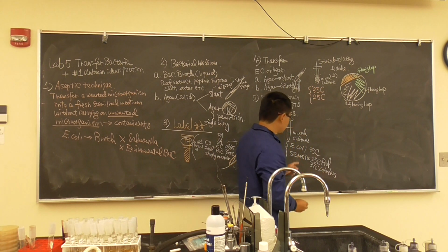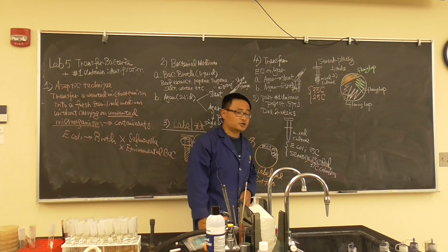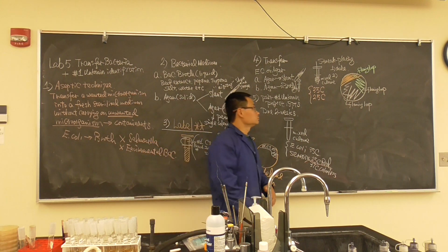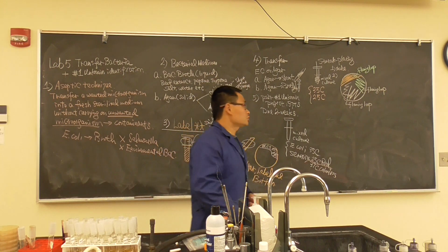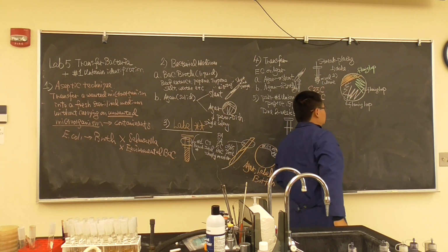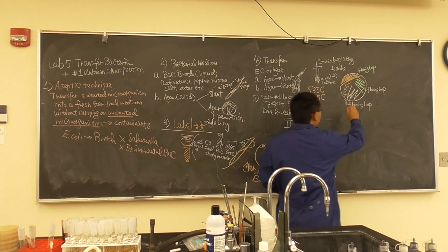The reason is at 25 degrees Celsius, Serratia will show red. So you and your batch partner will be incubated at a different temperature. Then what you will see? On Thursday, you will see there's some bacteria that looks colorless, and there is some bacteria that is red.